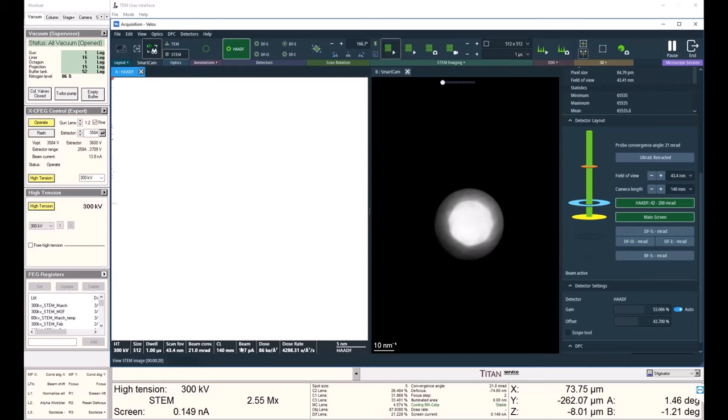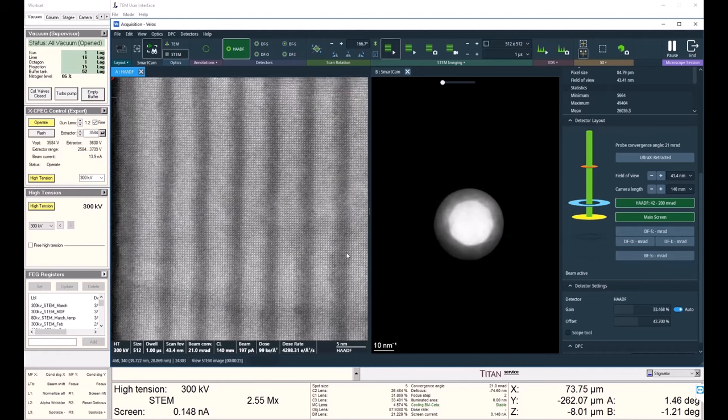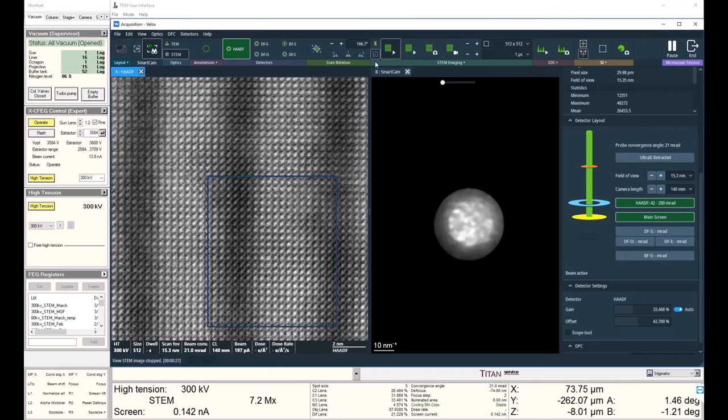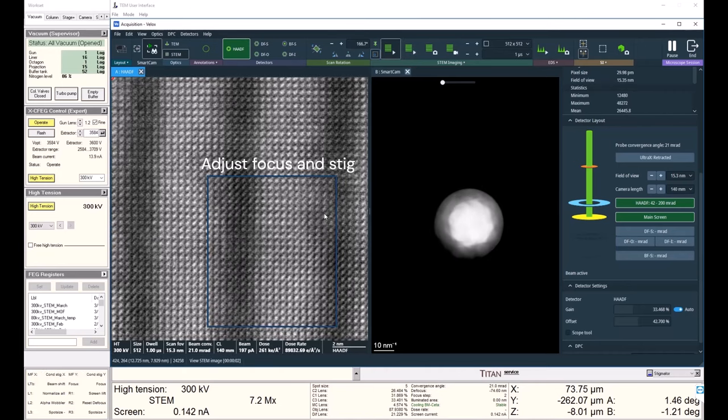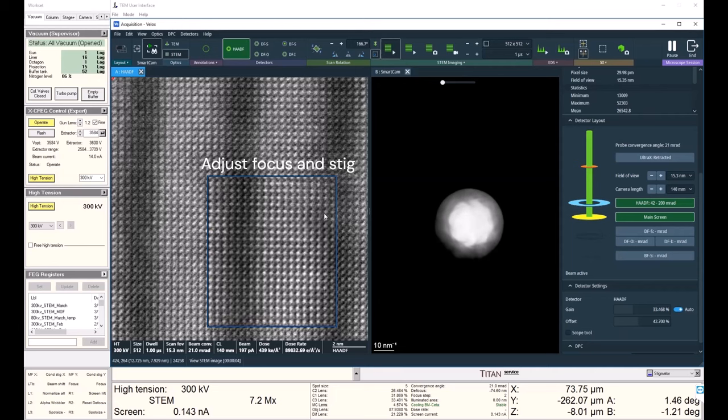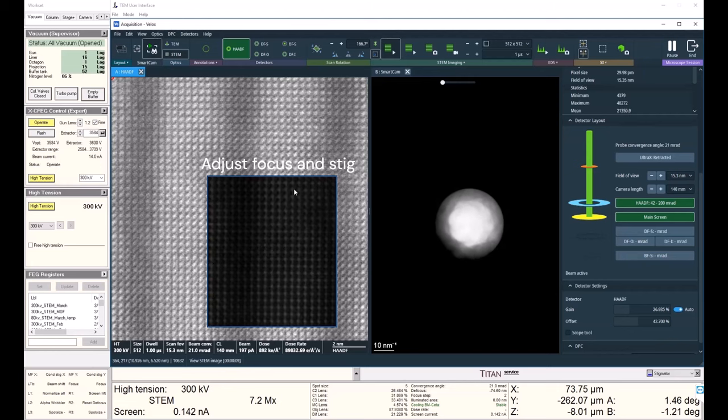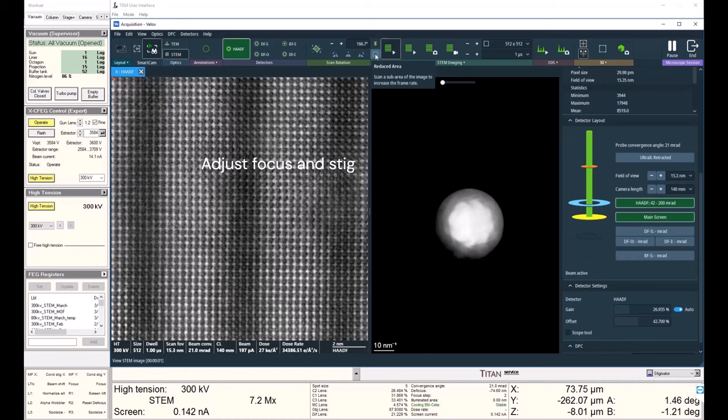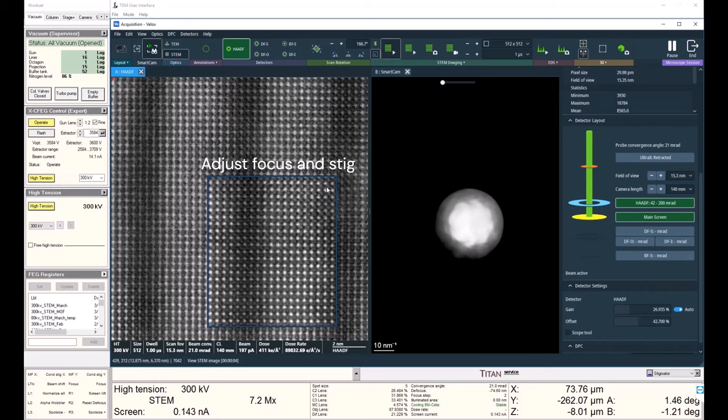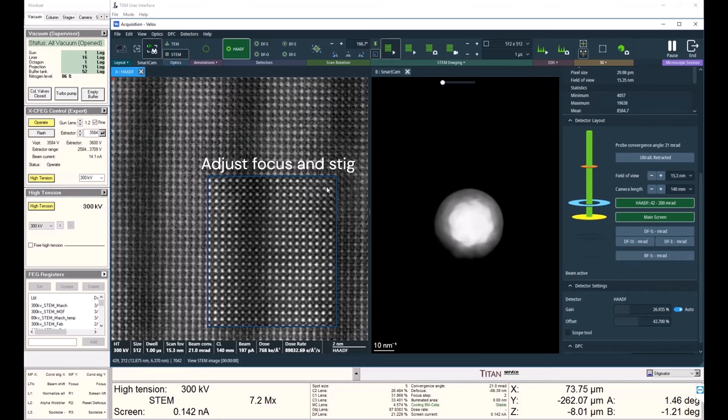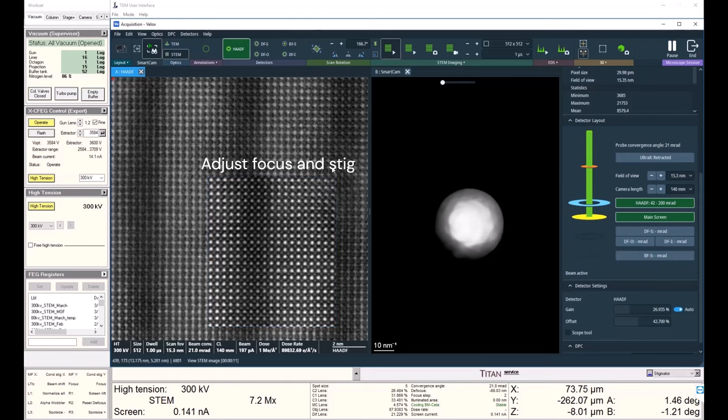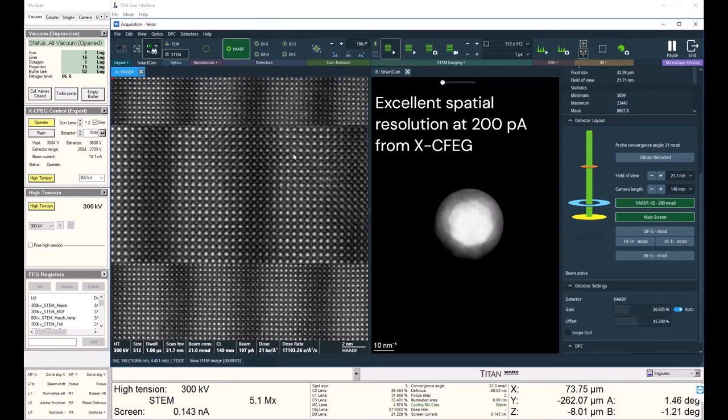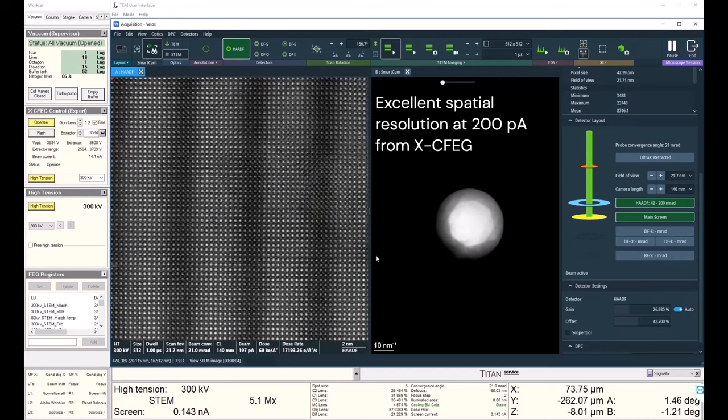I'll go ahead and touch up my focus and condenser stig. Let my HAADF readjust the gain and offset. And my atoms still look nice and lovely even at this high beam current because of the cold FEG, which maintains our great spatial resolution at high currents.